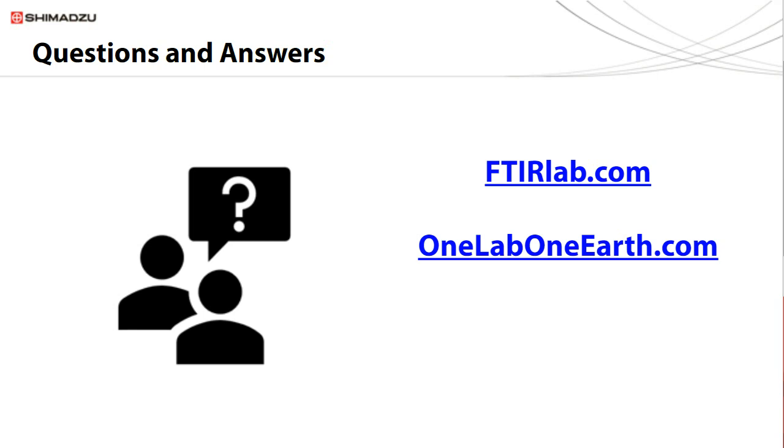Thank you for the question, Ruth. Yes, you are correct. The study here uses our high-end microscope. It has a liquid nitrogen cooled detector that allows it to measure low micron level sizes, and it is on the higher end as well. However, there are alternative systems. There is a smaller microscope, in fact, that uses a slightly less sensitive room temperature detector. The basic rule of thumb is that if you are looking for particles 60 microns or larger, this would be an excellent tool for you.